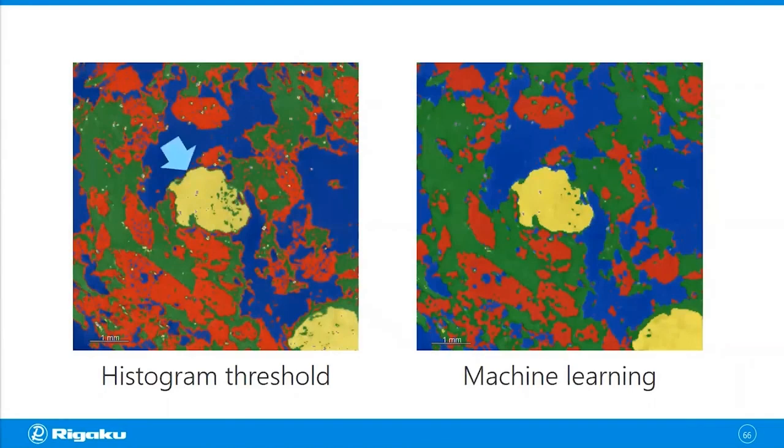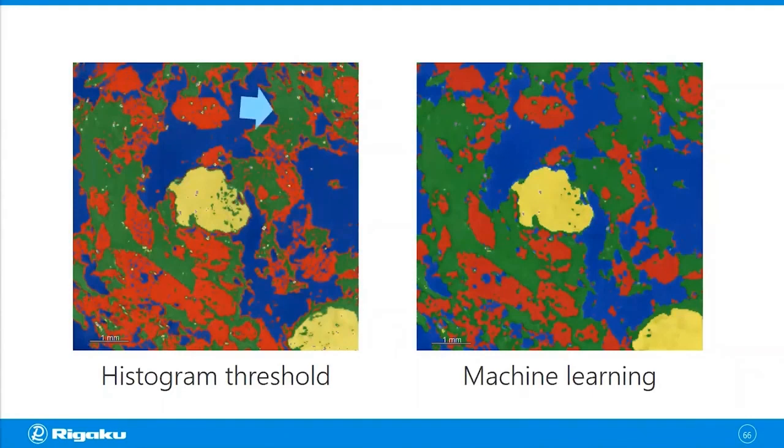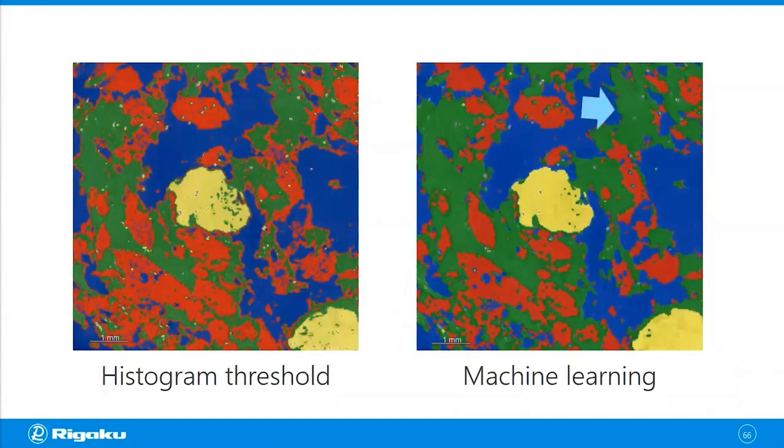You don't get the same problem with machine learning. It might be easier to see here. So you see the red phase kind of framing the green phase. Again, you don't have the same problem with the machine learning.